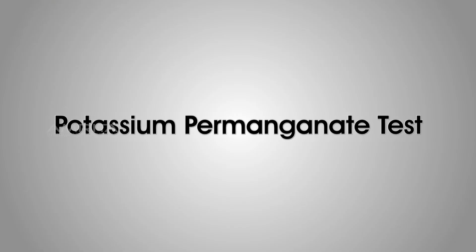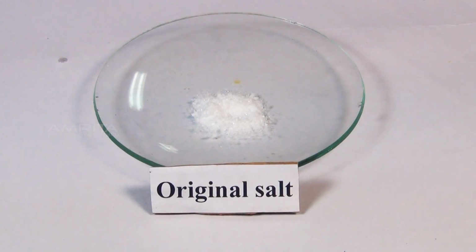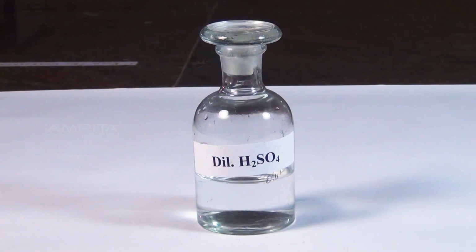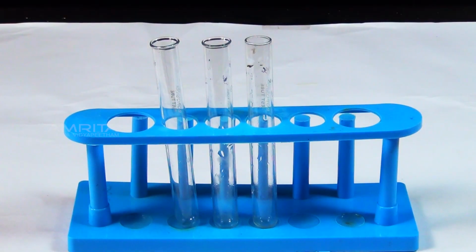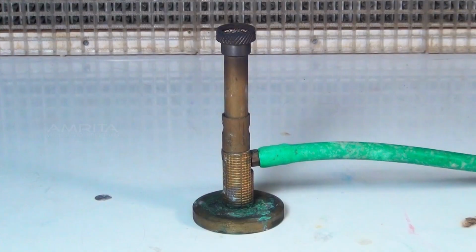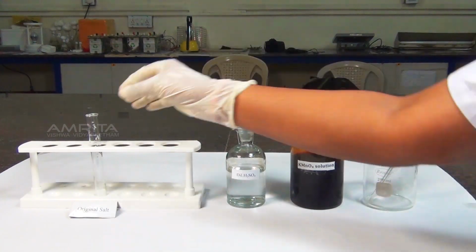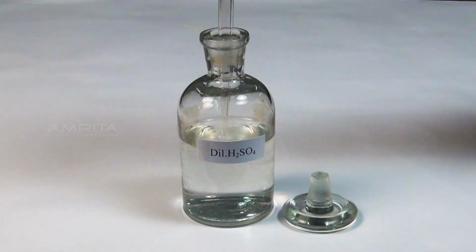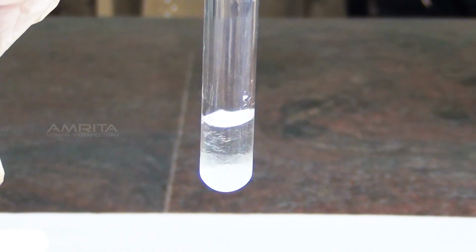Potassium permanganate test. Materials required: original salt, dilute sulfuric acid, potassium permanganate solution, test tube holder, droppers, and Bunsen burner. Procedure: take a small amount of the salt in the test tube. To this, add a small volume of dilute sulfuric acid using a dropper.